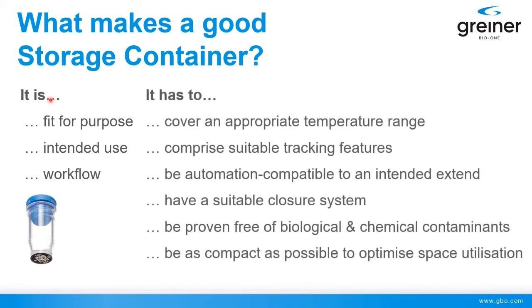But very often this means that an appropriate and often wide temperature range shall be covered, and products must be suitable. Also, tracking features must be suitable and must exist. It must be automation compatible, which often is important. There should be suitable closure systems. Products must be proven free of biological and chemical contaminants, at least concerning the state of the art.